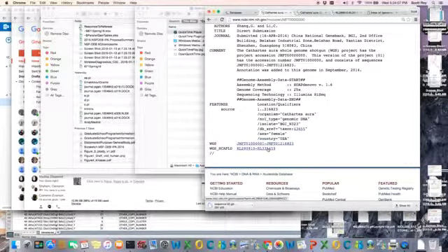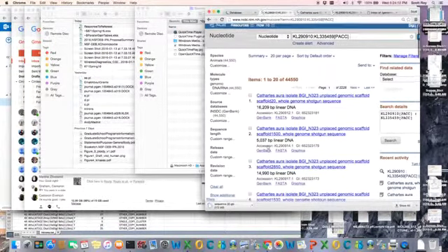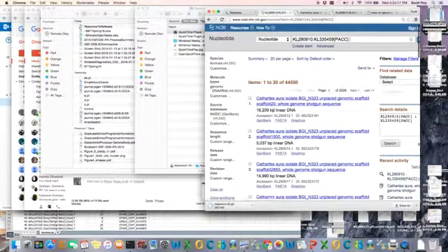It turns out in this case, this one happens to have annotation. I checked that beforehand. That's how I know. Okay, so now it takes us to here, and as you're probably familiar, each one of these is a chunk. So this is a 16,000 nucleotide chunk, a 5,000 nucleotide chunk, and so forth. And you see there are 44,500 of them.